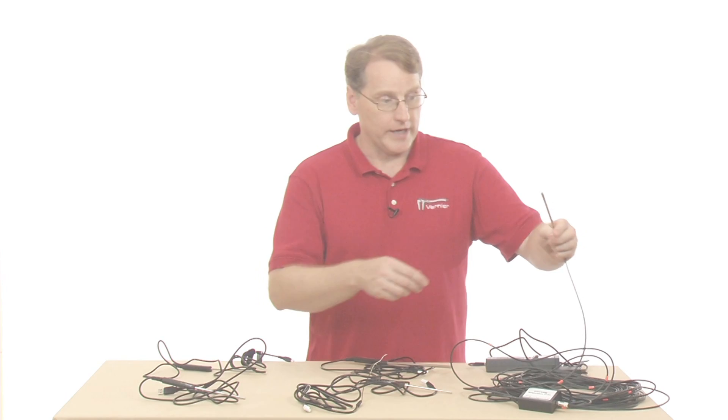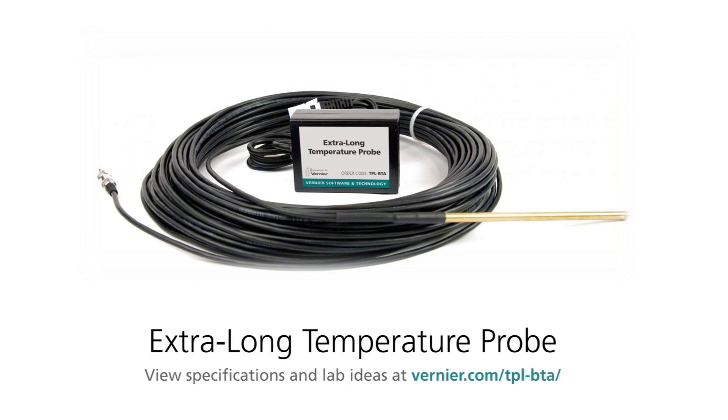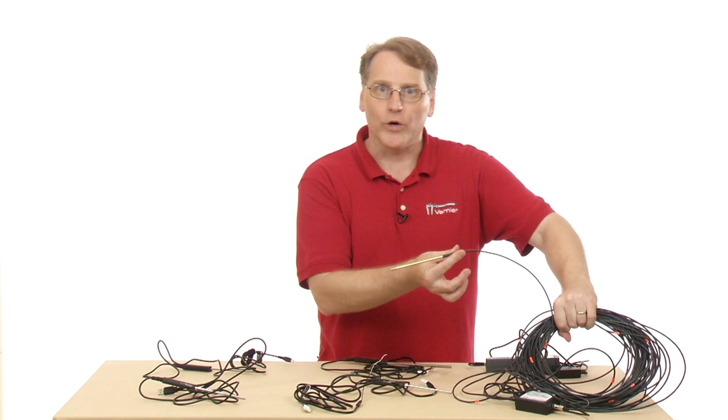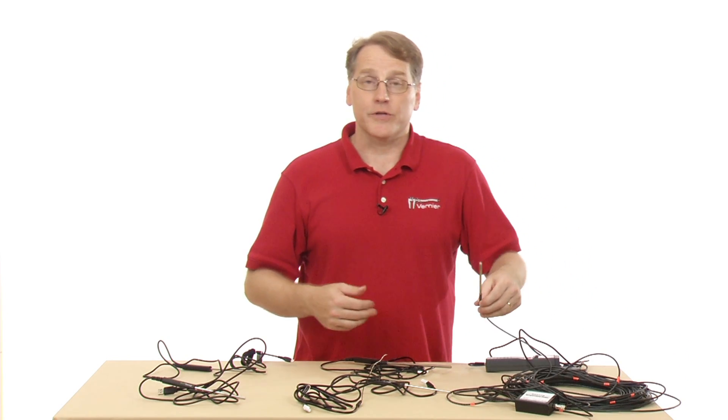And then lastly would be the extra long temperature probe. And so it has the sensor here. And the main difference with this one is the length of the cord.